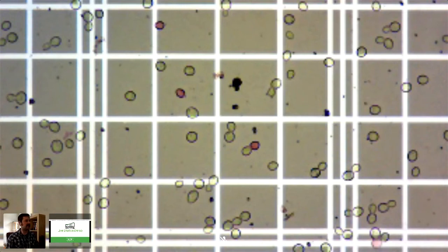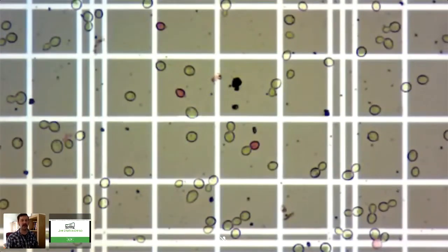And yeah, so that's kind of what's going on here. This is what things will look like. If you're using methylene blue, whenever you do your staining, you need to let it cure for about 2 minutes, I think. But you can't just put the dye in and then take a sample and load it onto your counting chamber right away.